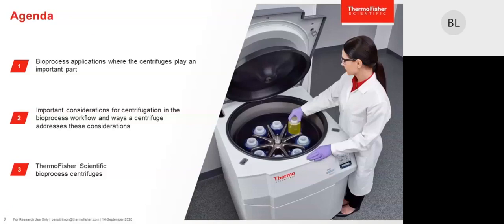There will be 3 sections in the presentation. First, we will remind ourselves of the bioprocess application, and be more specific on which typical applications the centrifuge plays an important part in.